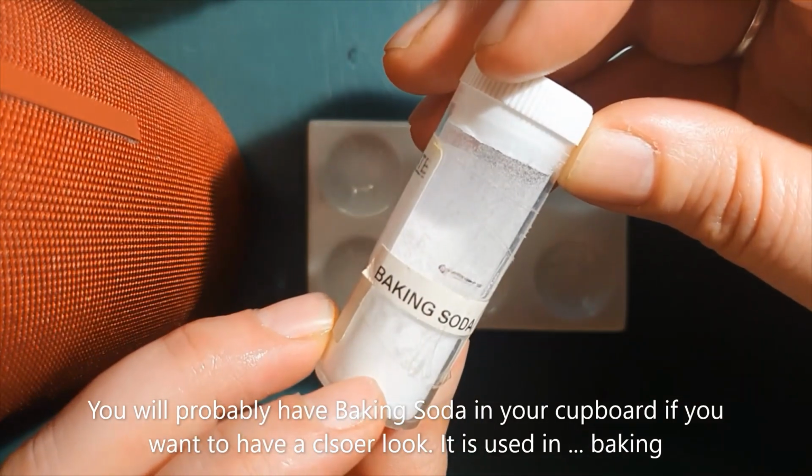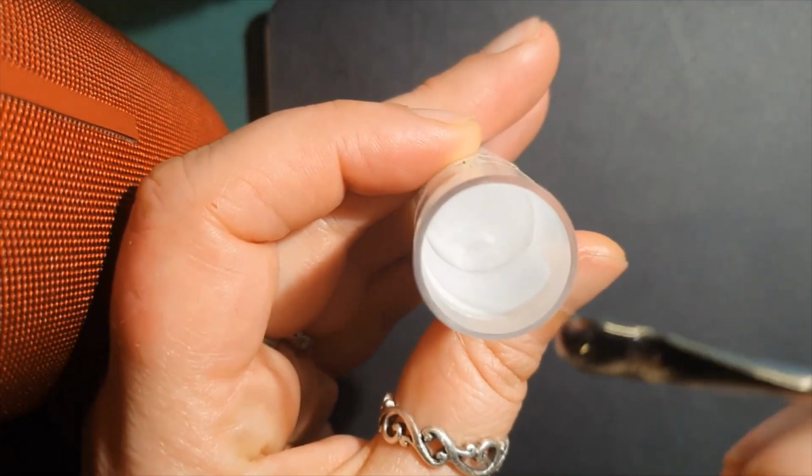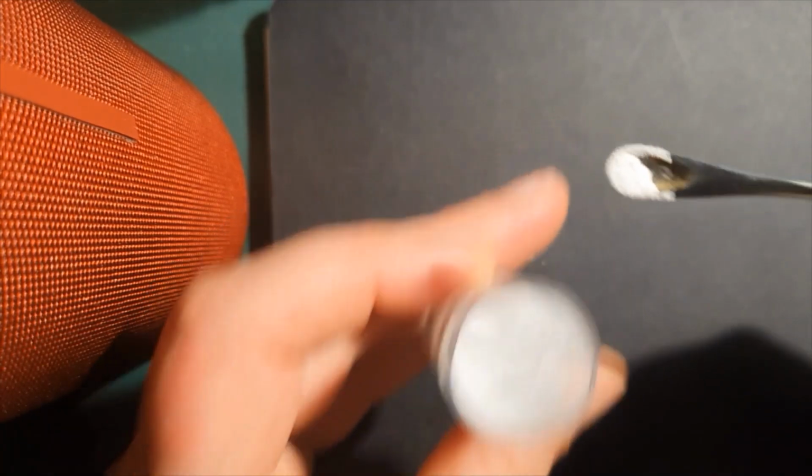So there it is, baking soda. Oh, I'll show you the appearance first. What color is that? It's clearly white. All right, so there is some baking soda. I'll bring the camera closer. There you go. Okay, so it clearly looks a bit different to, what did we look at? Starch. It looks a bit more grainy. Not as clumpy. But yeah, write down what you think in the appearance.